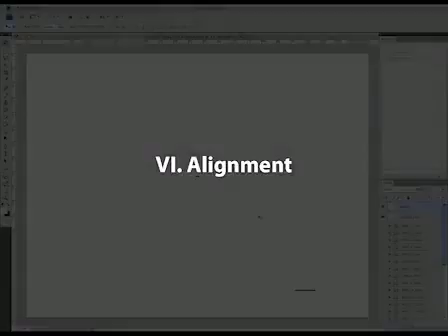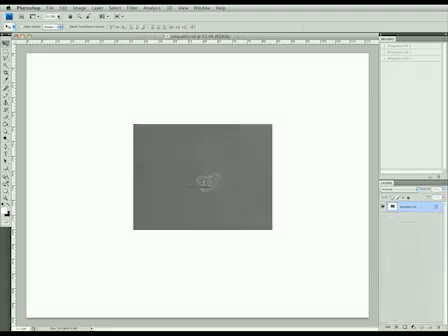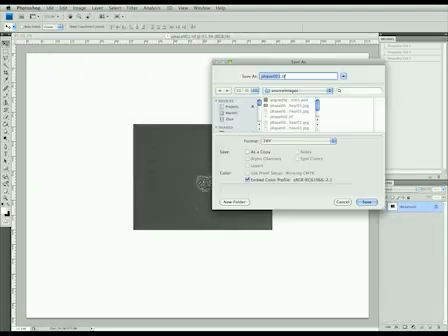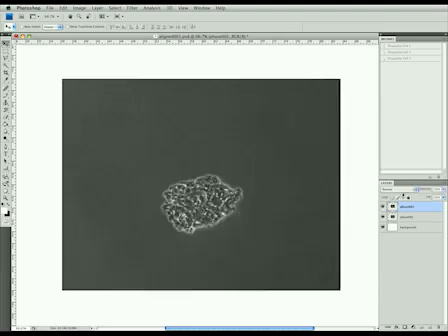Images with resident scale bars of 10 micrometers and 50 micrometers established in OpenLab 3.56 software are imported into Photoshop CS4 using a standard canvas size of 3,300 by 2,550 pixels. All serial section images are saved as TIFF files maintaining the standard canvas size. Open the first and second phase contrast images of the neurosphere serial sections. Increase the transparency of the second section.